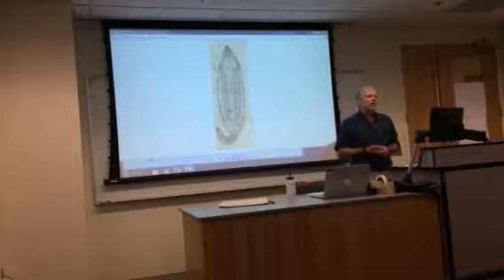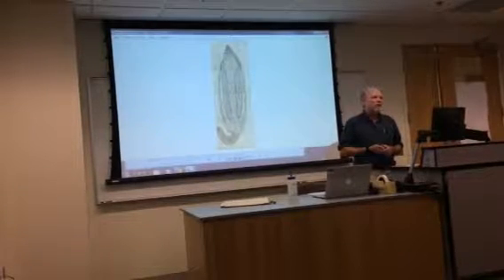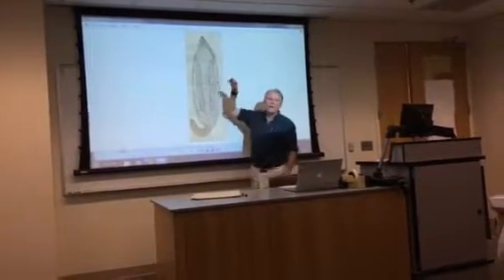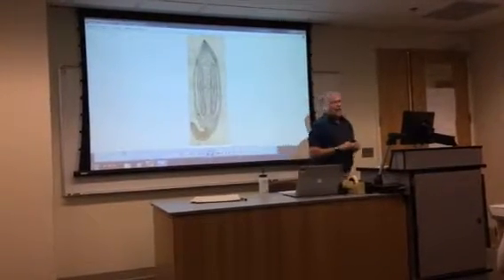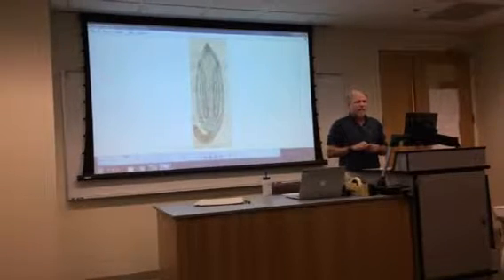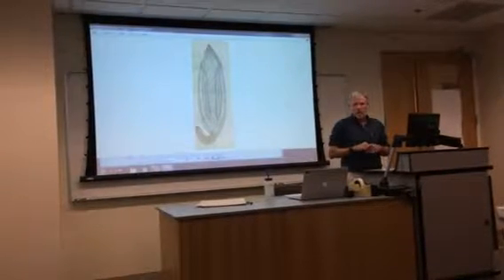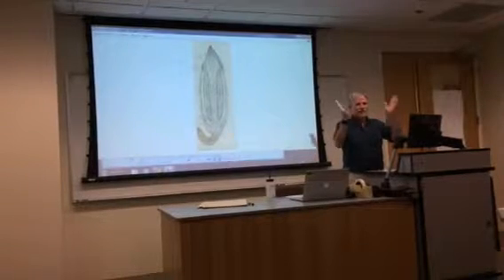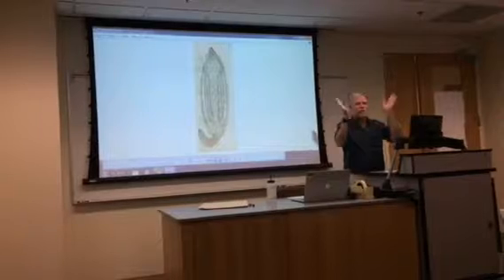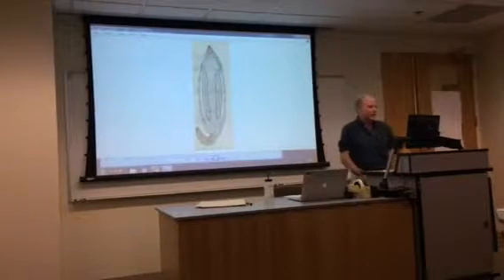Instead, they have peristome teeth. Peristome means around the mouth. So around the mouth, that is the top, this thing opens up. There are these teeth, and they respond to hygroscopic movements, changes in humidity. If you get them out of the lab at a light source with a scope, you'll see how they actually do this. They'll do like that. Right? And they're actually digging in and digging out the spores and ejecting them as the humidity changes.